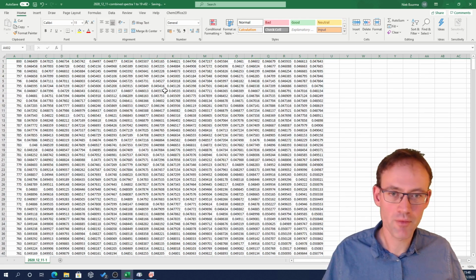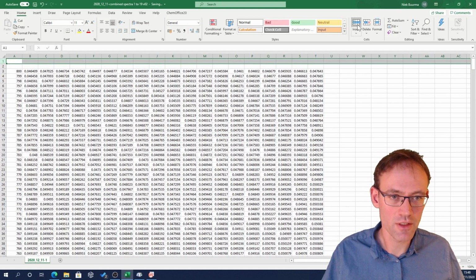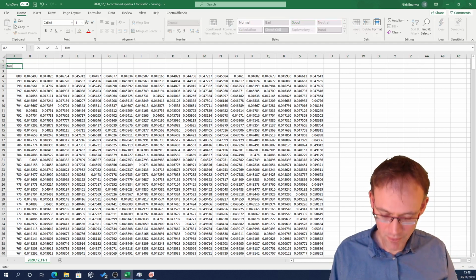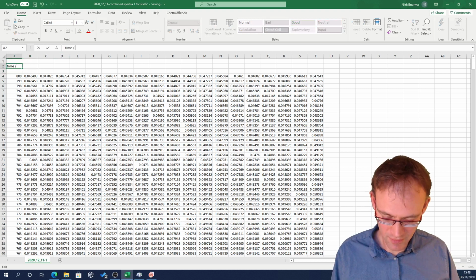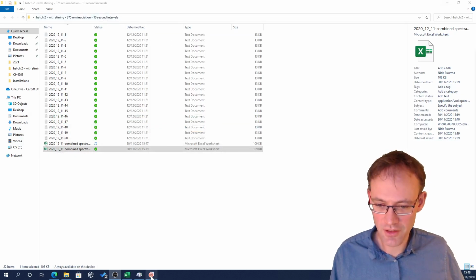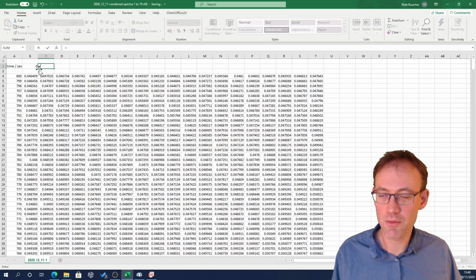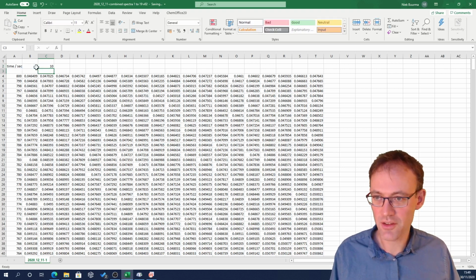At the same time, I know a few things about these data that I am now going to add to these data. And what I know is the timing of the different data points. So I'm going to write the time, and I'm going to give that in seconds. If I go back over here, these were the data with 10-second intervals. So I know that this is time 0, and it means that this spectrum was recorded this plus 10 seconds later.